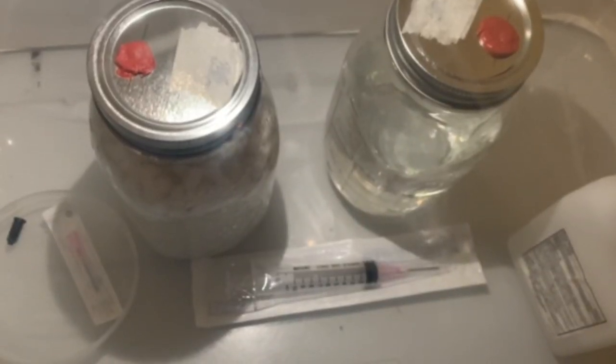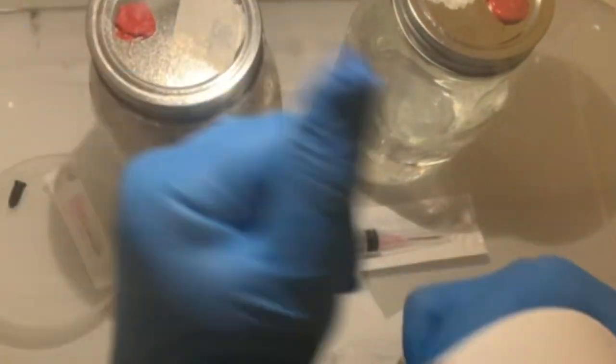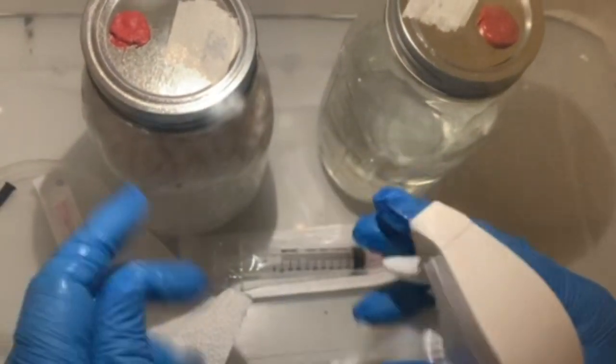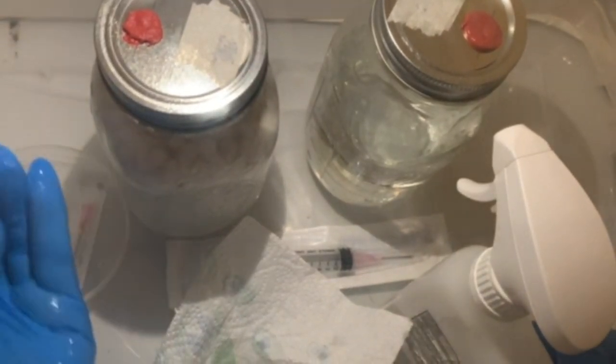Once the jars are cooled down to room temperature you can start with the next step, which is to make a syringe of sterile water. Make sure to wipe your work area down with isopropyl alcohol and then use your sterile syringe to draw out a full 10 to 12 milliliters of water from the jar.